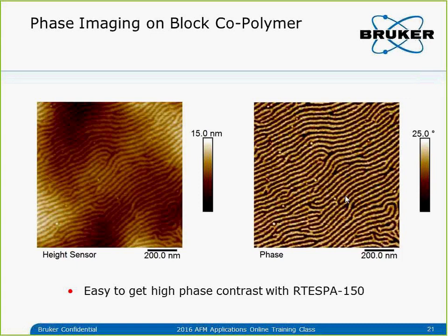And in this case, the spring constant is very important. That's why if you look at the probes for MFM, for EFM, or for KPFM, all those probes are soft tapping mode probes. The spring constant is probably a few Newton per meter. They never use very stiff cantilevers for those applications, because in those applications we want to detect the phase. And the medium-soft tapping mode cantilever is the best for phase sensitivity. And same thing for the tapping mode phase here, right?